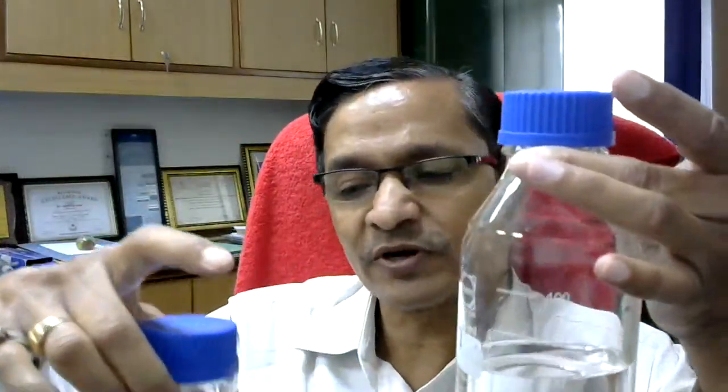This is a 500 ml bottle. You can see 100, 200, 300, up to 400 marking is there, and here also you can see marking is there. So roughly you can have an idea how much solution is left. That is why this marking is there. This is not for measurement, just to have an idea that yes, I have 100 ml, 200 ml, or roughly 250 ml solution left. If I require 300 ml, then this may not be sufficient and I should make fresh. If I require just 100 ml, then this is more than sufficient, my work can be done with the remaining solution. So for having a rough idea, these markings are there. These are not for measuring.